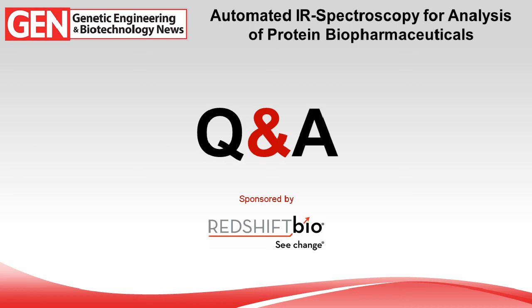The regulator is asking us about this because in the pen formulation there are two additional excipients: one is a preservative, the other is a detergent. They want to know if, in the real pen formulation, the secondary structure of your protein stays the same, because these two additional excipients interfere with the far UV CD analysis.